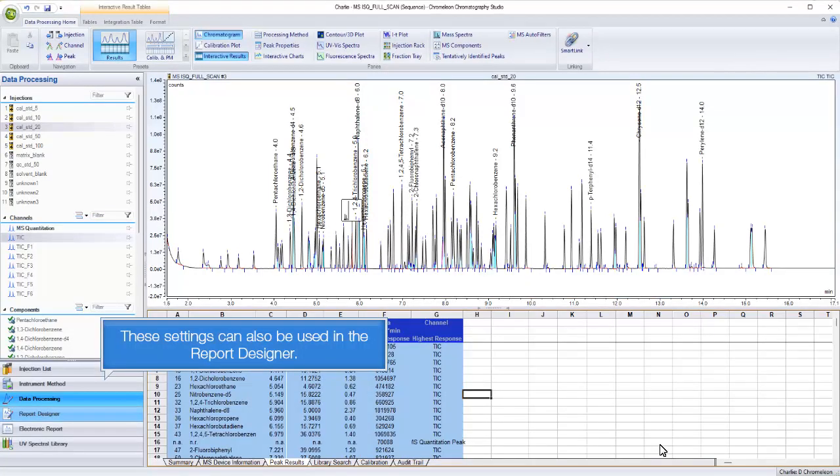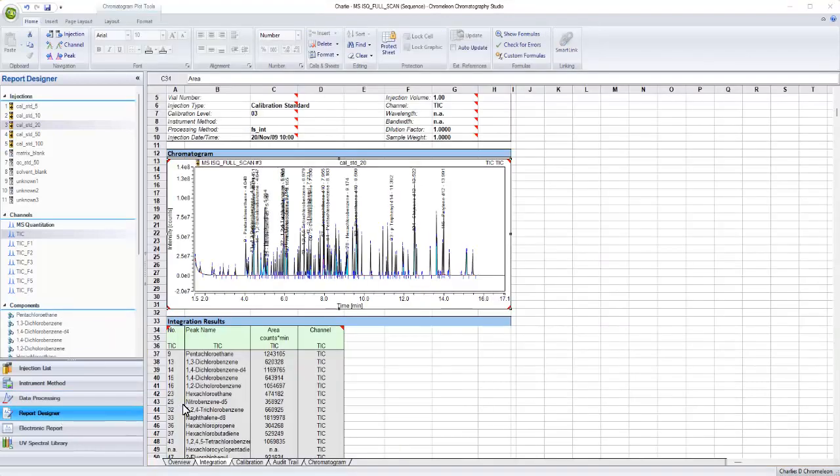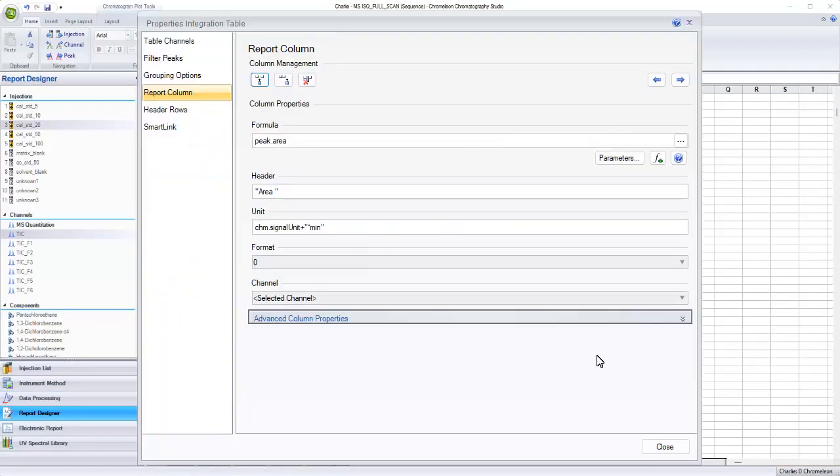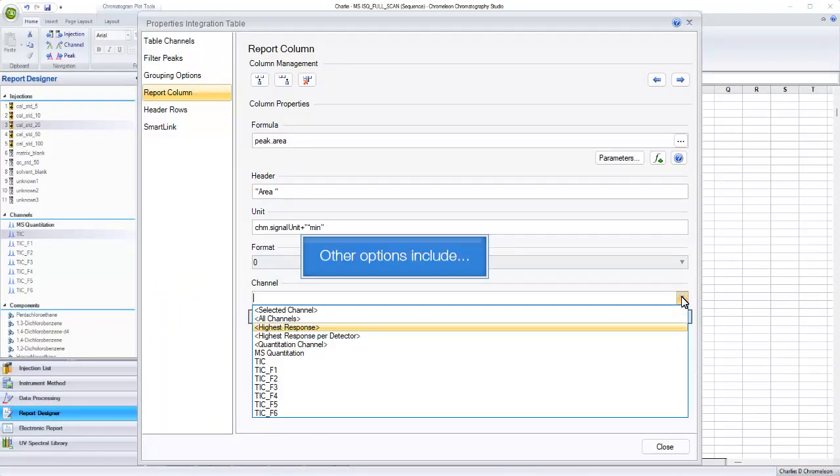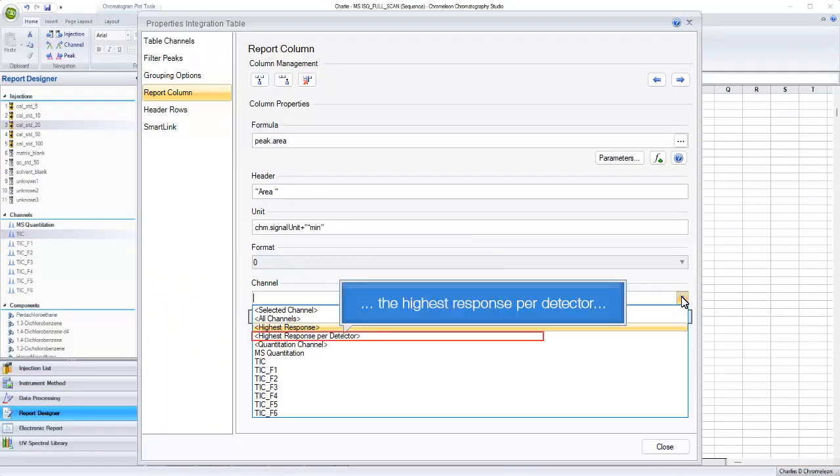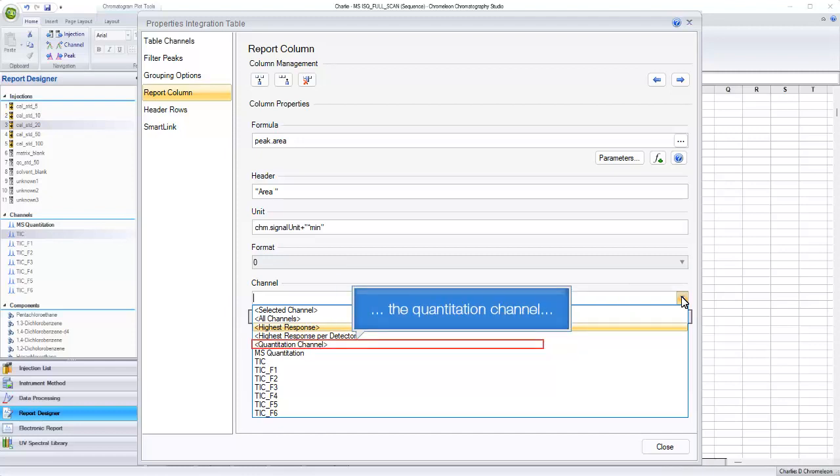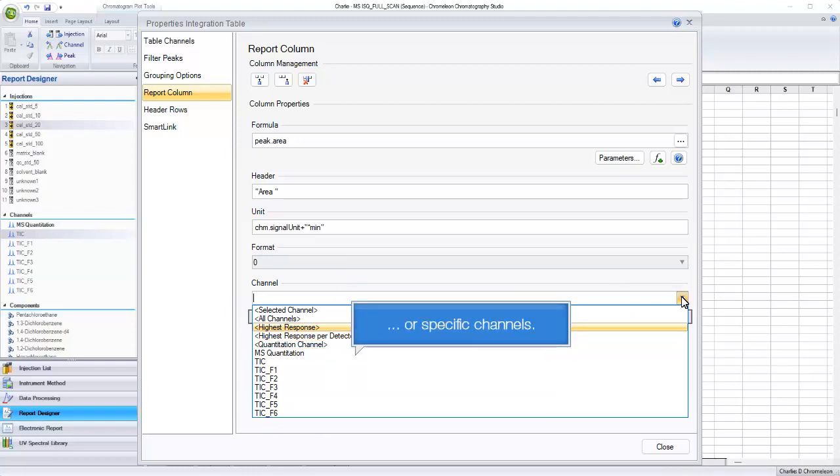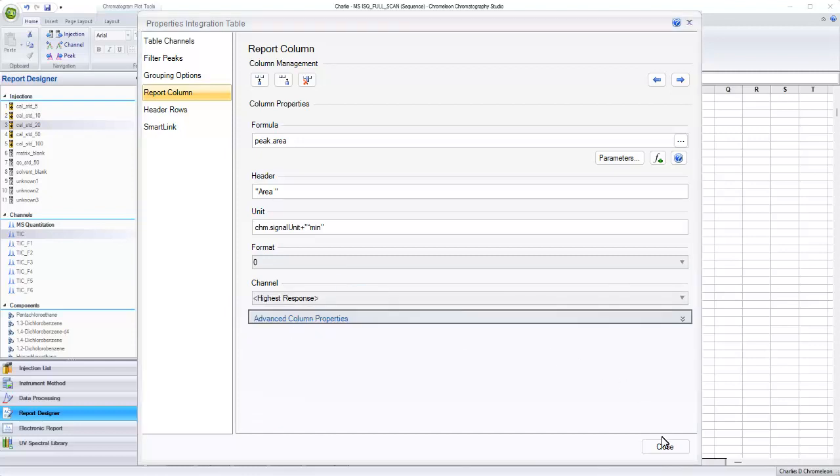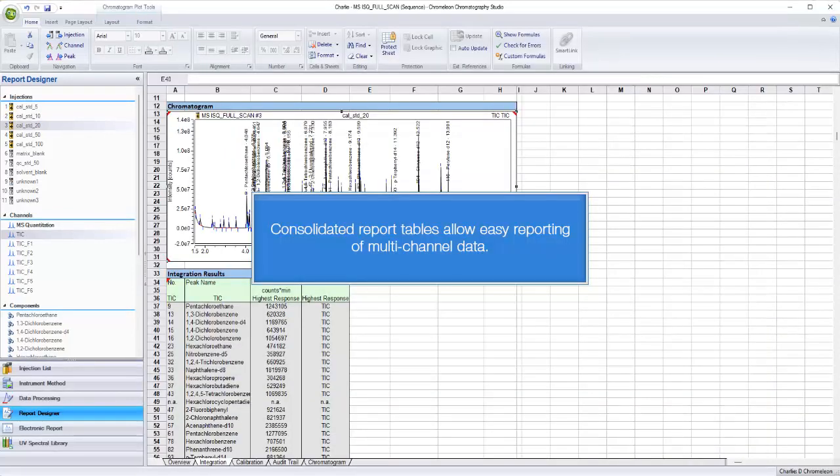These settings can also be used in the report designer. Other options include the highest response per detector, the quantitation channel, or specific channels. Consolidated report tables allow easy reporting of multi-channel data.